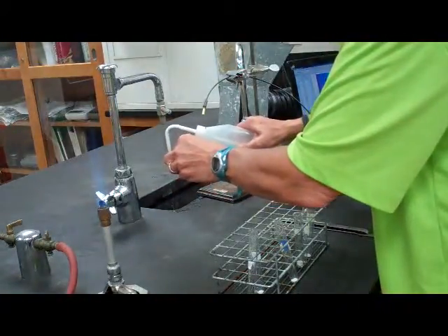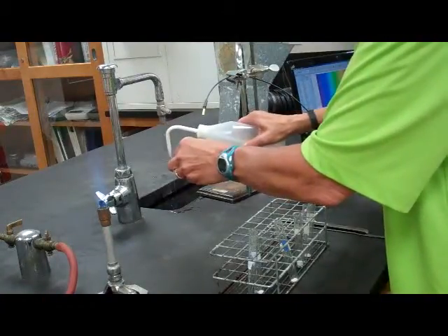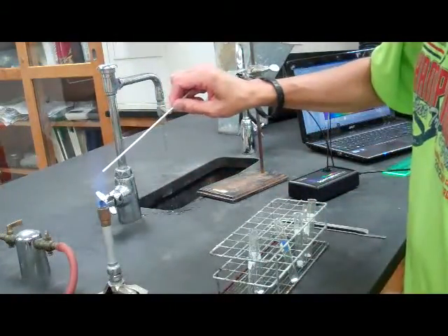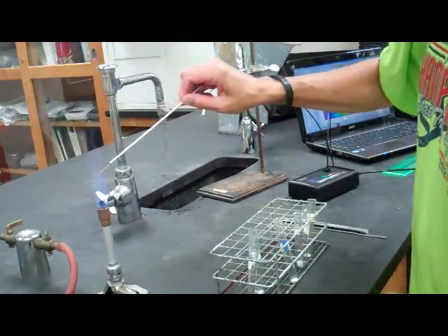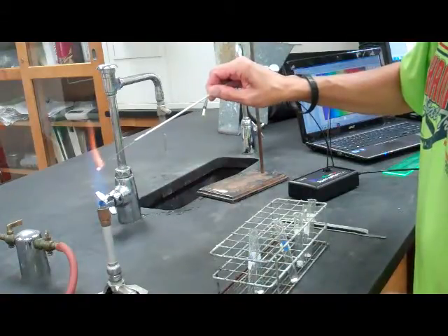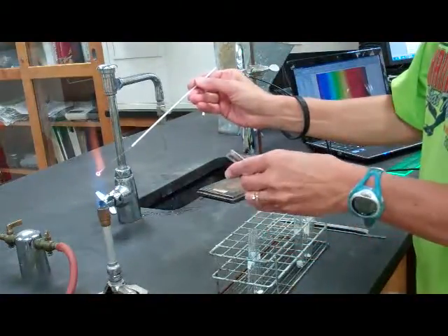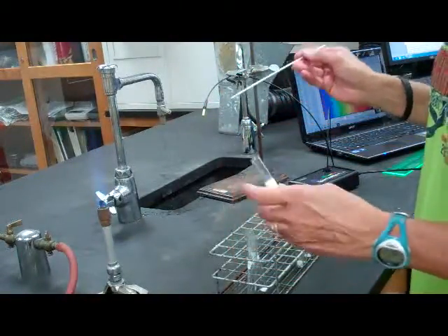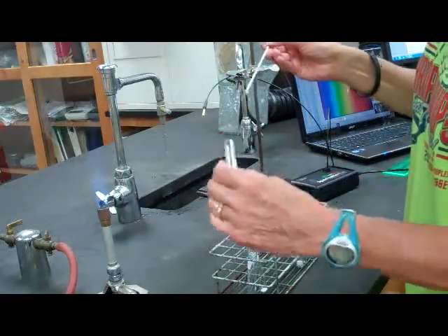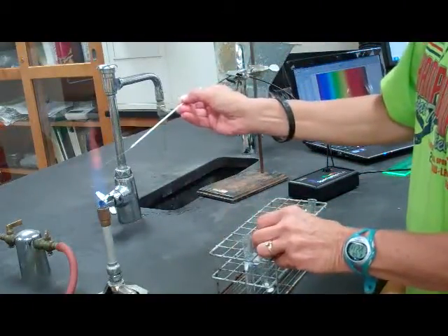Once again, rinsing our loop, at least a minute in between. Burn the loop, starting at the handle end. Looks pretty clean. We don't have that contaminating color from the loop. That's just our color from the beginning. So we move from sodium onto potassium chloride, getting a sample of the salt into our flame.